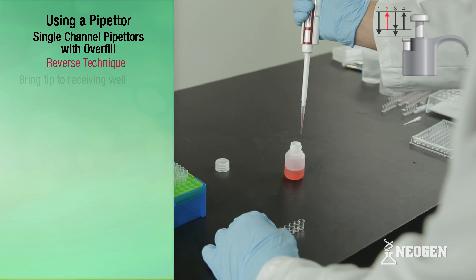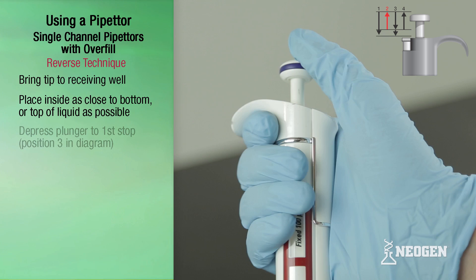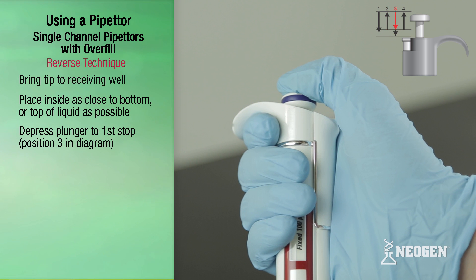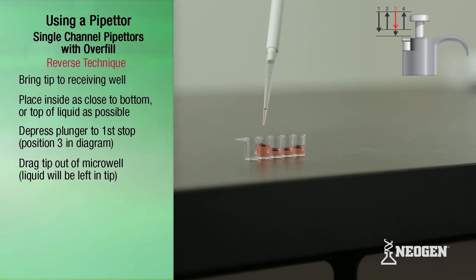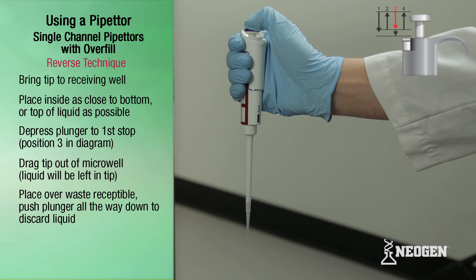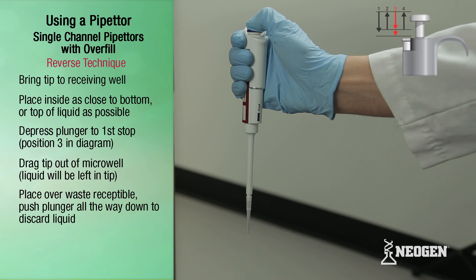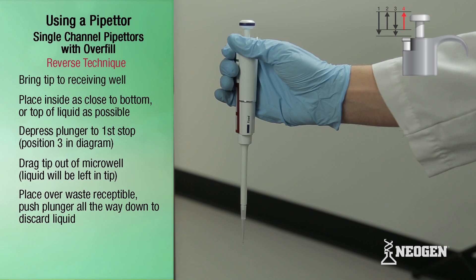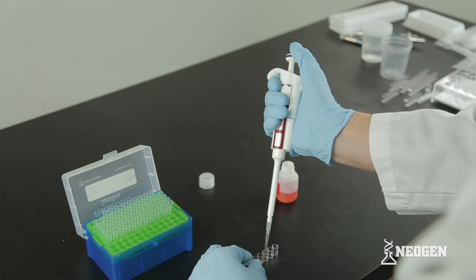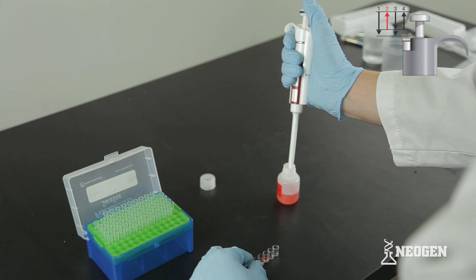Bring the pipetter with the filled tip to the receiving well and place the tip against the inside wall of the well as close to the bottom, or as close to the top of any existing liquid, as possible. Slowly depress the plunger to the first stop — position three — and drag the tip out of the microwell. There will be liquid remaining in the tip. If you're finished pipetting, position the pipetter with tip over a waste receptacle and push the plunger knob all the way down to discard the remaining liquid, then release the knob to position four and eject the tip. If you're not finished, position the tip over the container, push the plunger knob to position one, and repeat the drawing up and dispensing of liquid.